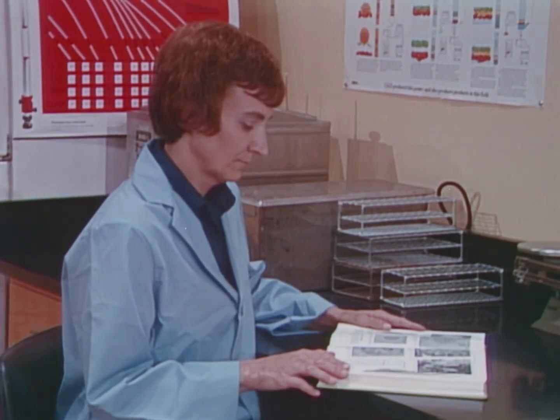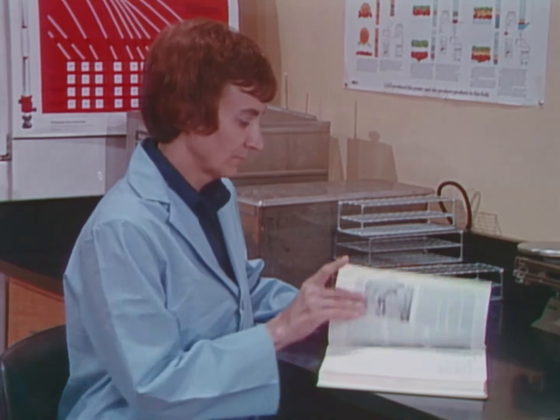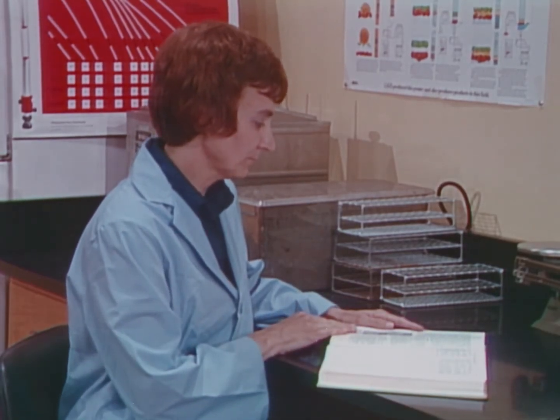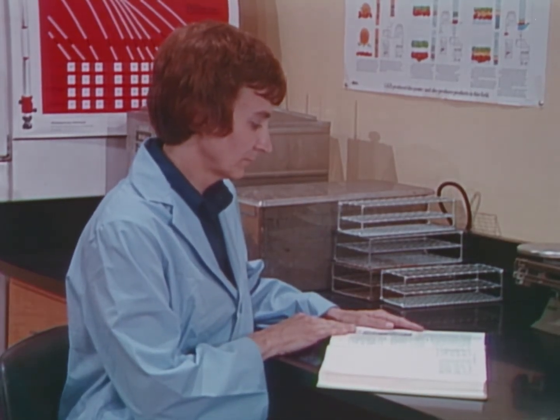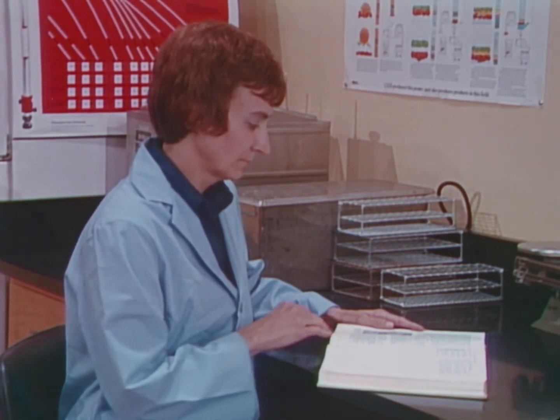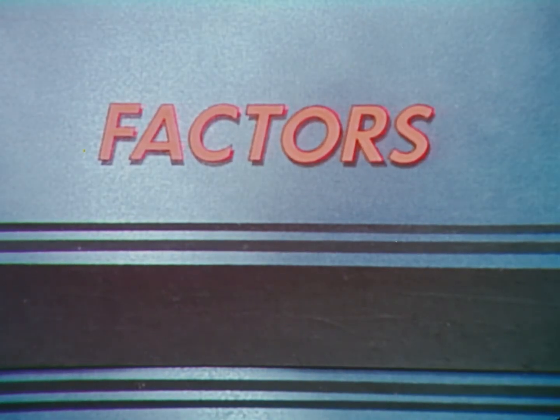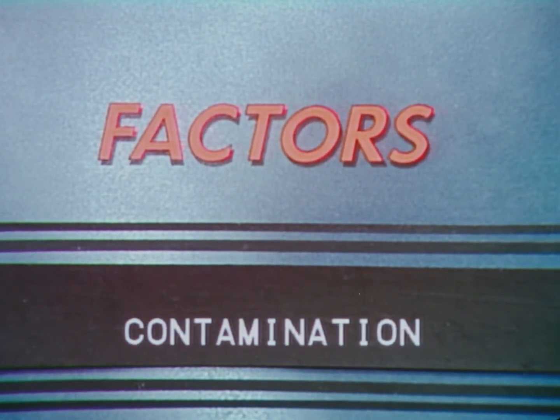Interaction between these 4 factors will vary with each pathogen handled. This is why the microbiologist must have a detailed working knowledge of any disease-producing agent he or she is to study.